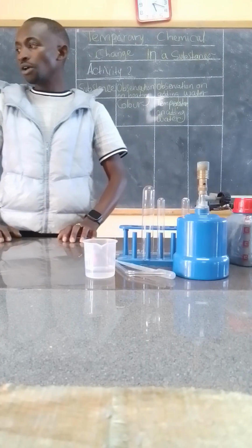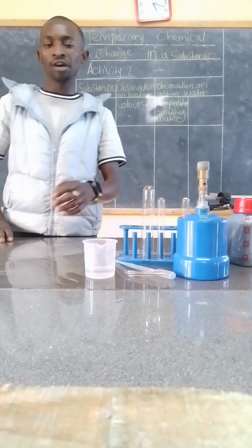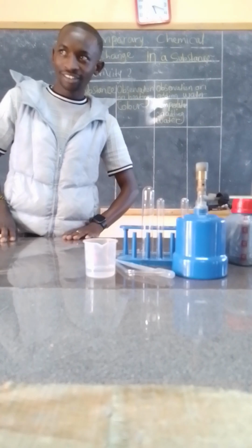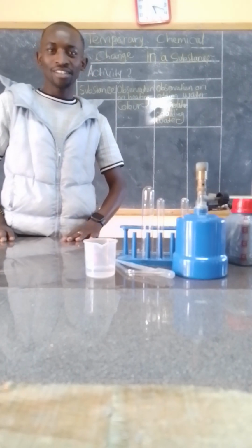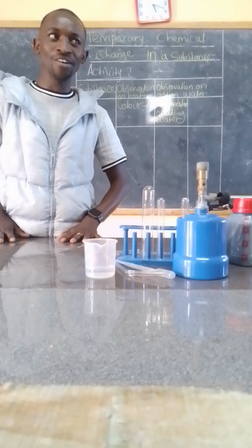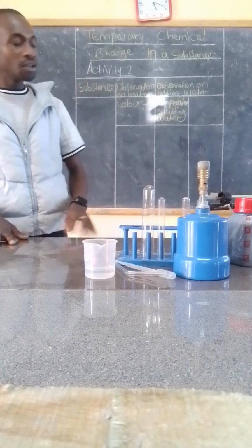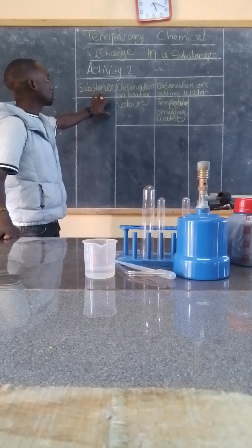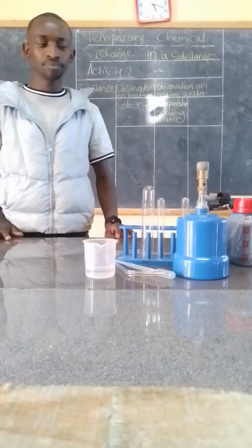So, having all the apparatus set, if you are a learner in grade 8, tidy your tie well, sit up well, and be ready for learning of integrated science lesson. Copy this table in your book, as this is where you're going to fill in all the observations.